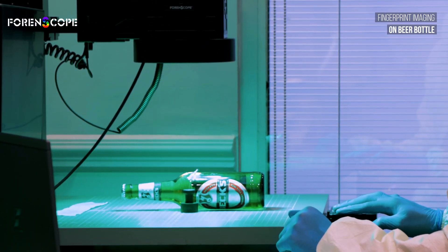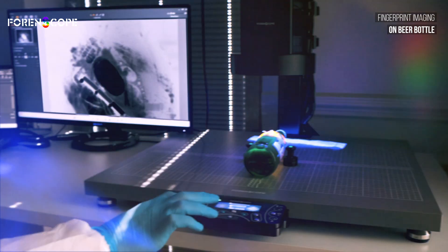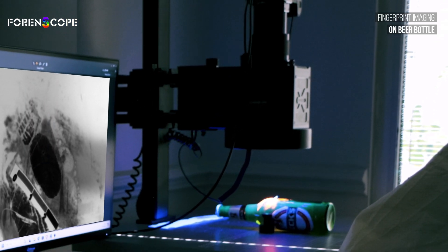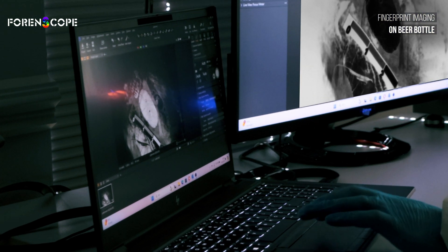The device offers easy usability with a comfortable copy stand, ensuring anyone can operate it without expert knowledge. Powered by a 32.5-megapixel CMOS sensor, it captures high-resolution raw photos, instantly editable on your computer.